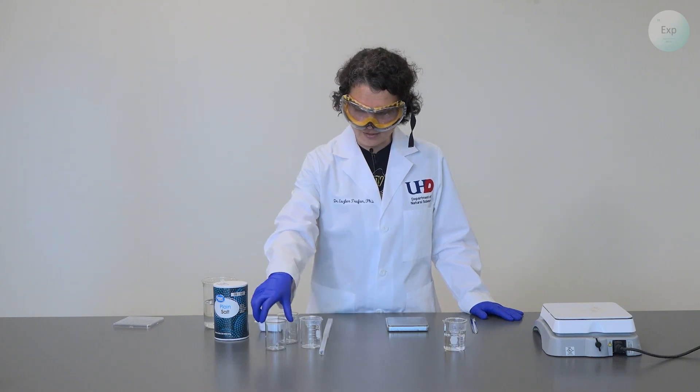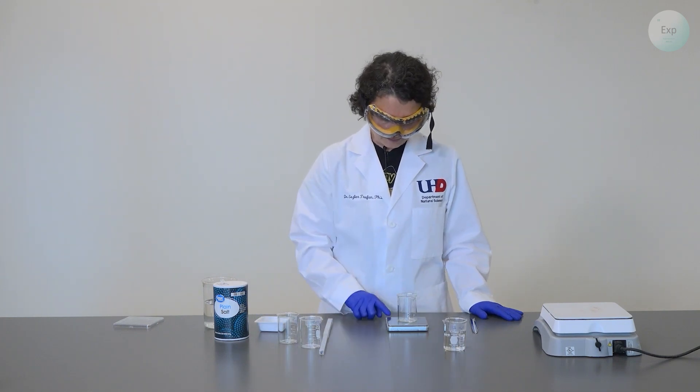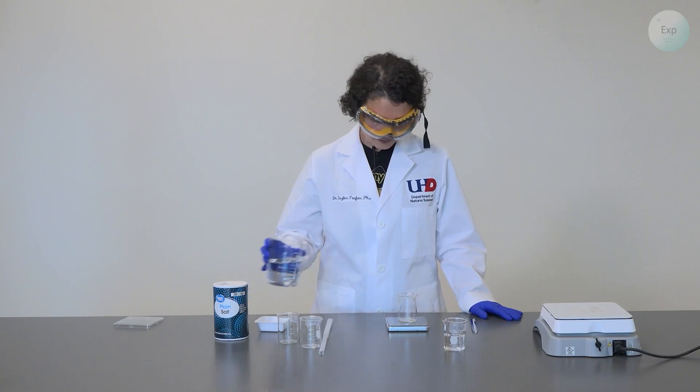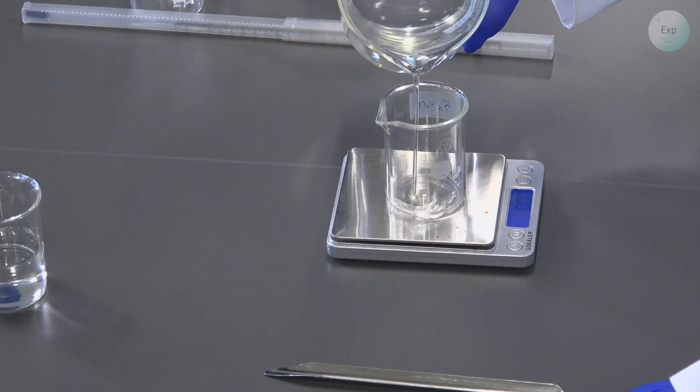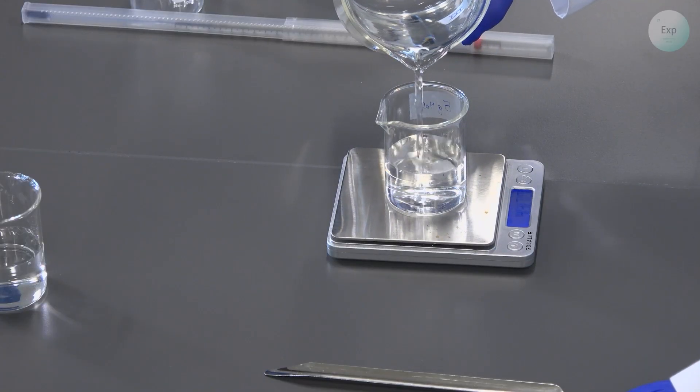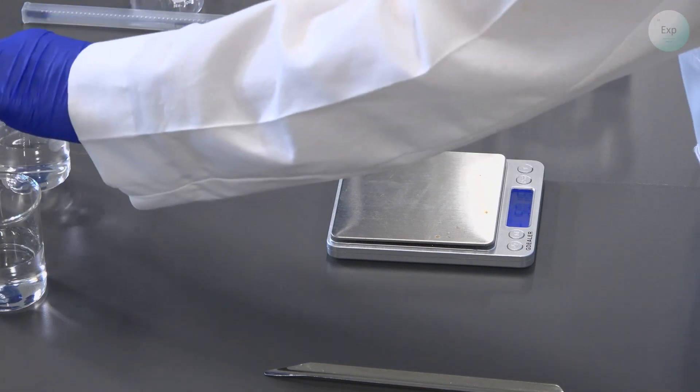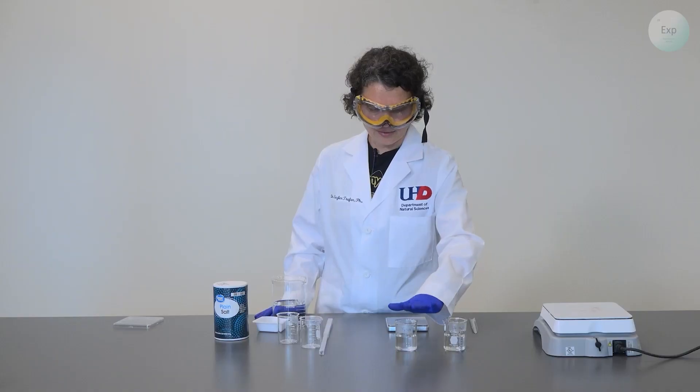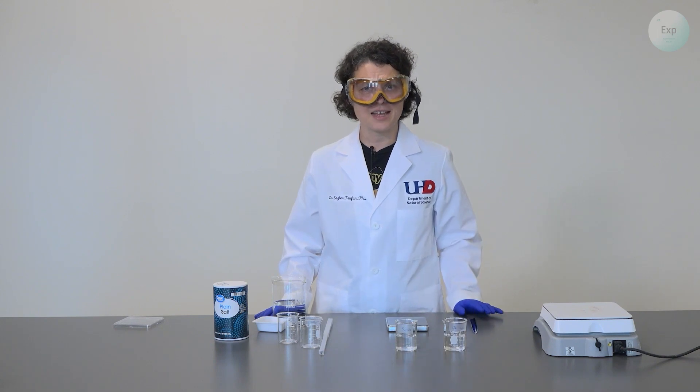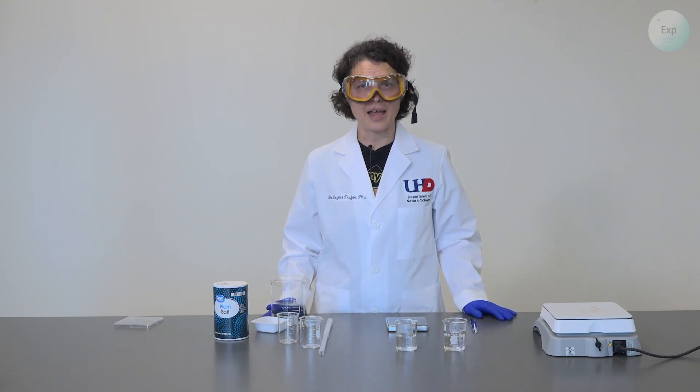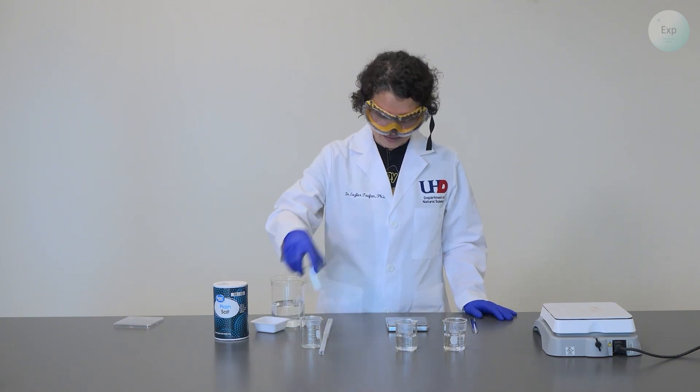Next, I'm going to move on to my second beaker, tare it, and measure out another 50 grams of water. I have 49.85 grams of water. I labeled this beaker with a label that says 5 grams of sodium chloride because that is the amount of sodium chloride I will add to it in just a little bit.